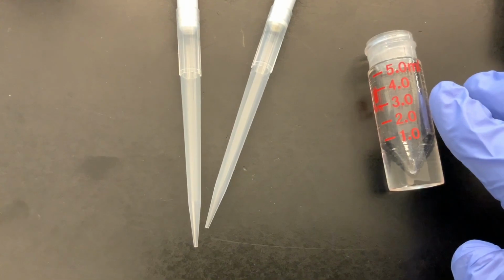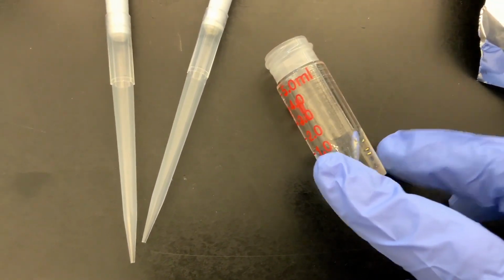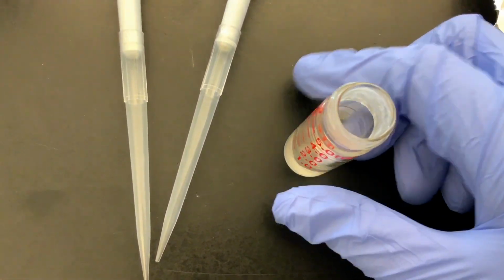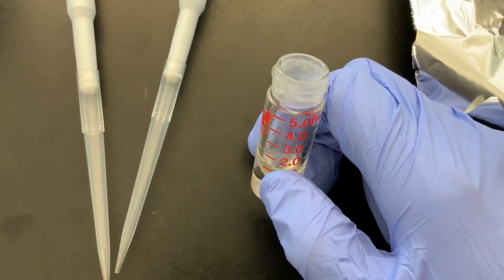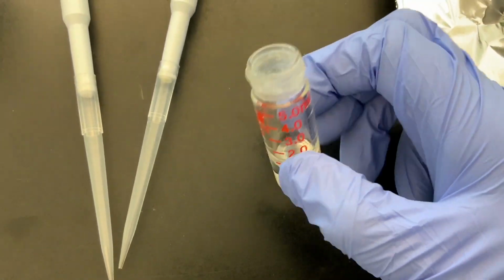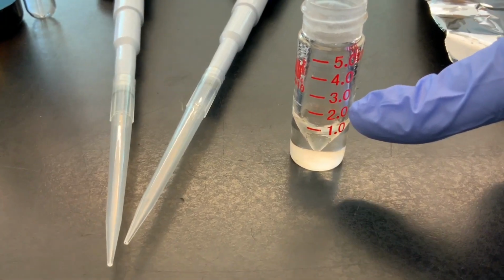So we're going to combine 1 milliliter of hexane with 1 milliliter of toluene into this 5 milliliter reaction vial. You can see it's heavy walled glass here. This one has a flat bottom surface, so it can stand straight up on itself, rather than a conical vial, which cannot, and of course the round bottom flask cannot. Since we're going to be adding around 2 milliliters total, our volume is going to be around that.